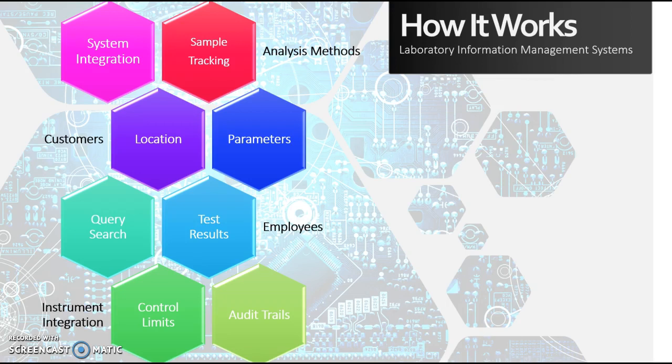LIMS can pull the collected data to create customizable reports for both internal and external customers quickly. It can be used to improve on existing systems or methods within the laboratory and can include quality control and assessment trails at the same time that samples are being analyzed to ensure that accurate and precise results are being provided. It also easily manages data workflow and consumables.